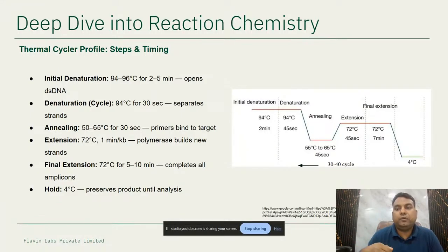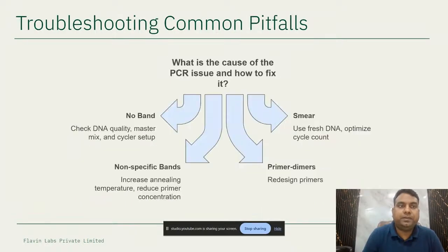As the temperature gets lowered, your polymerase will stop acting because the temperature is very low. After this we will load it into the electrophoresis unit and we observe the bands. Okay, hope it is clear. I'm not going very deep because we have a time constraint of 1 to 1.5 hours, so we can't go deep down. If we do, then we can't cover the in silico validation process and primer designing step.